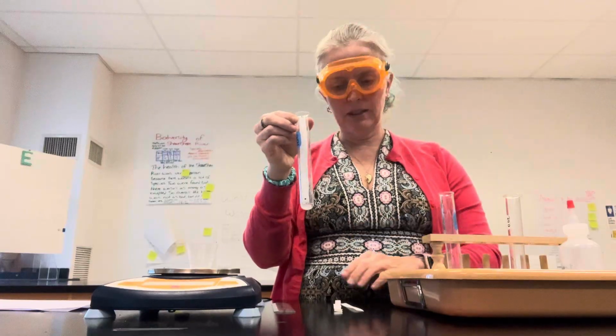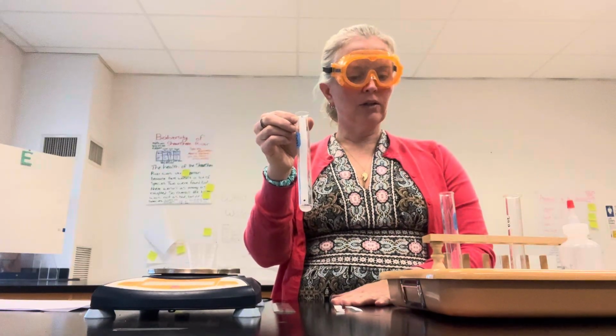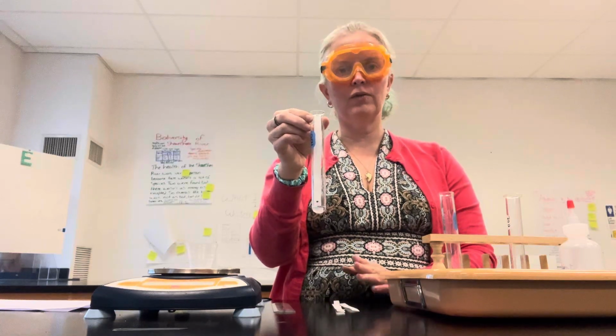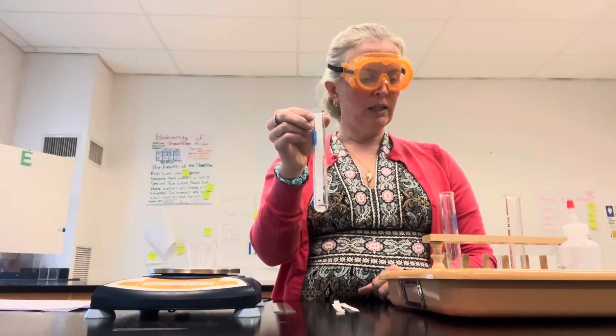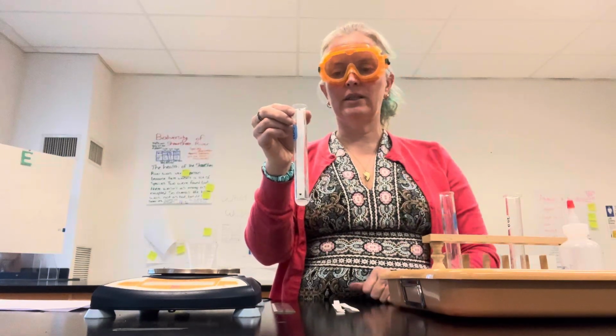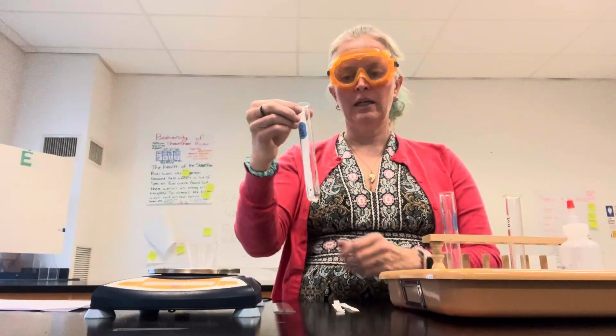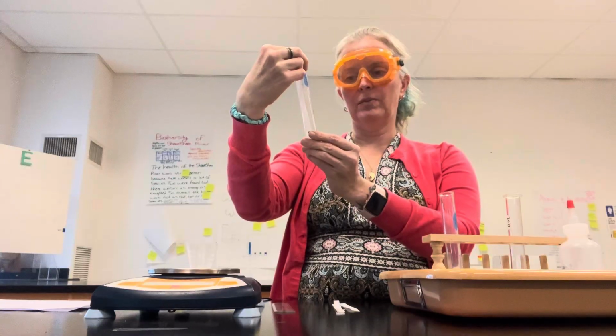You're going to use the same procedure for your 2 other pens, and you're going to allow them to climb up the paper, and when they're finished, or when you see enough of a difference between the 3, then you can write your data down in your lab notebook and use that data to help you decide which person was the one who forged the pass.